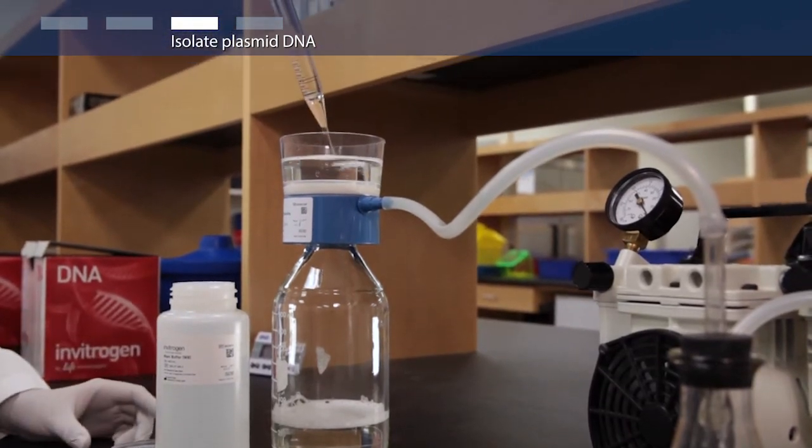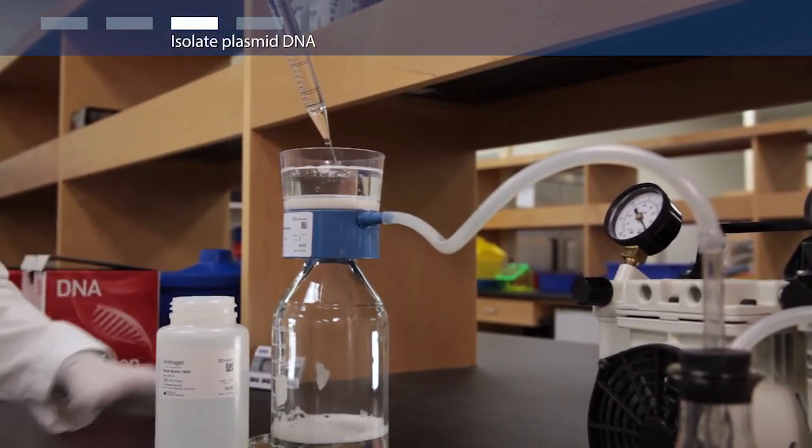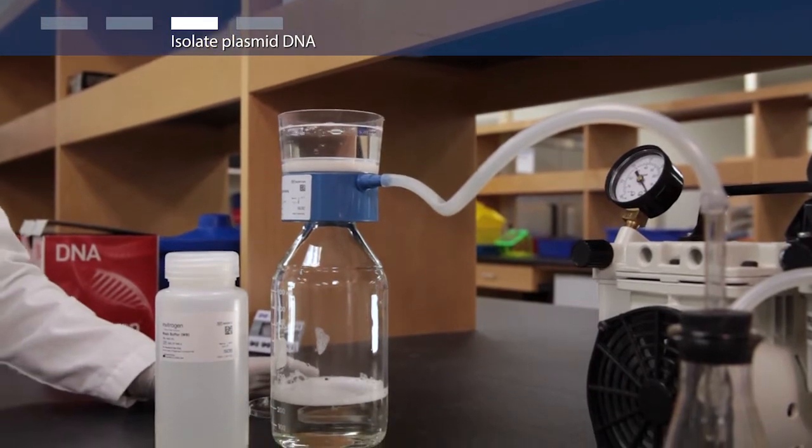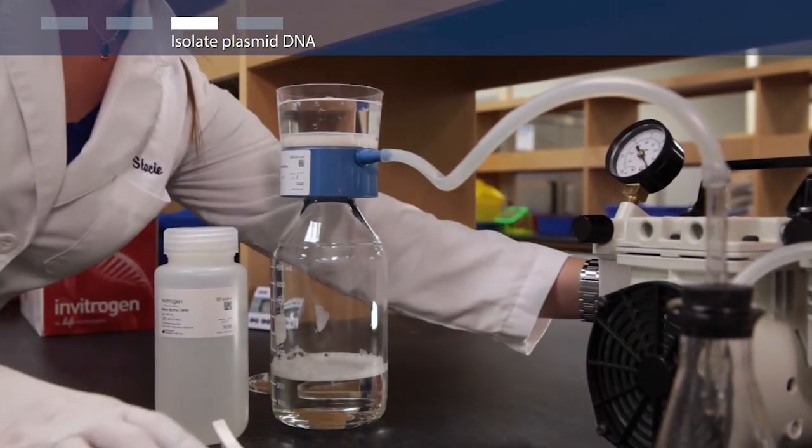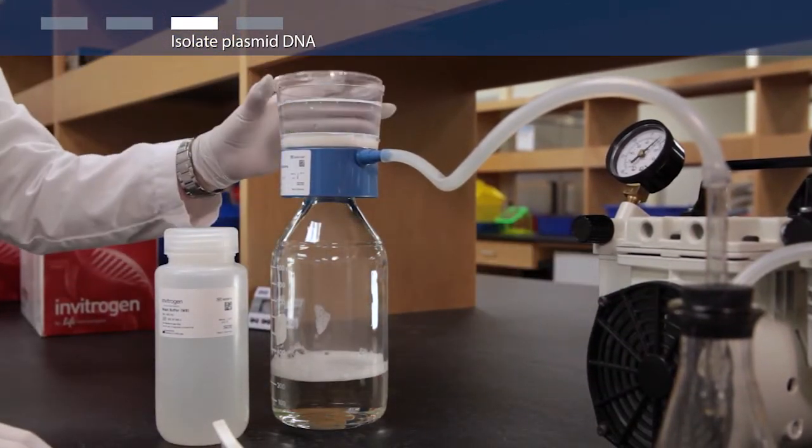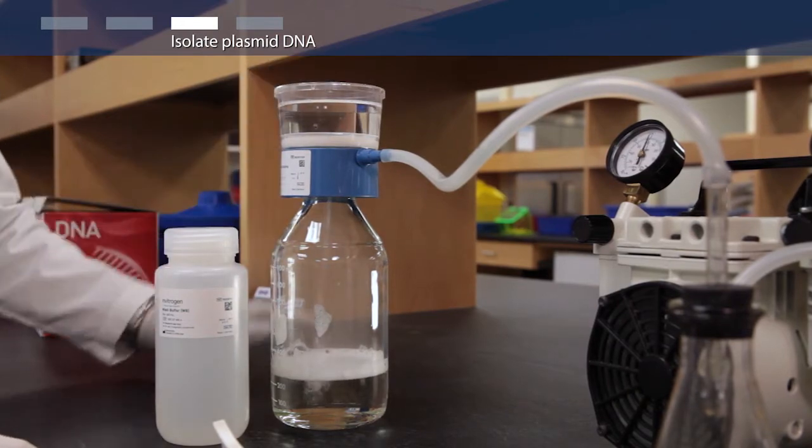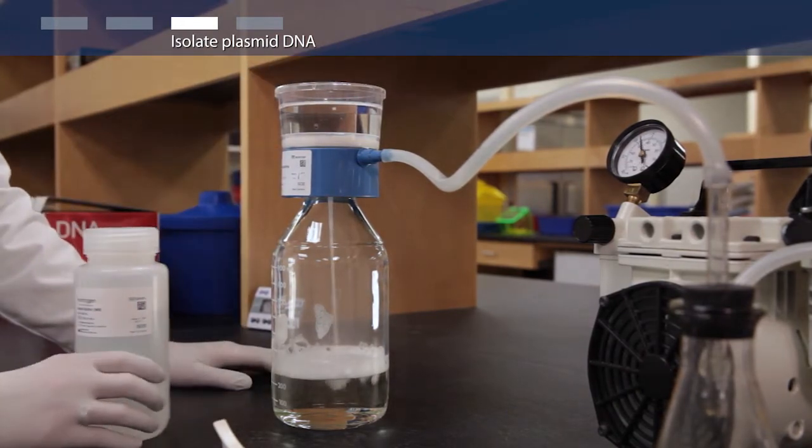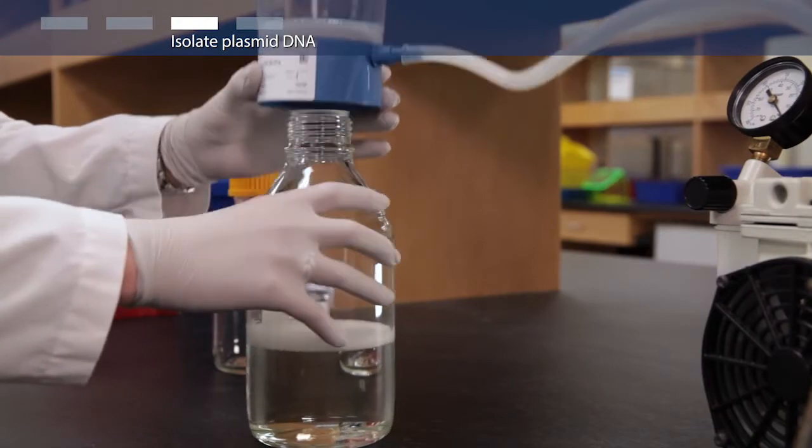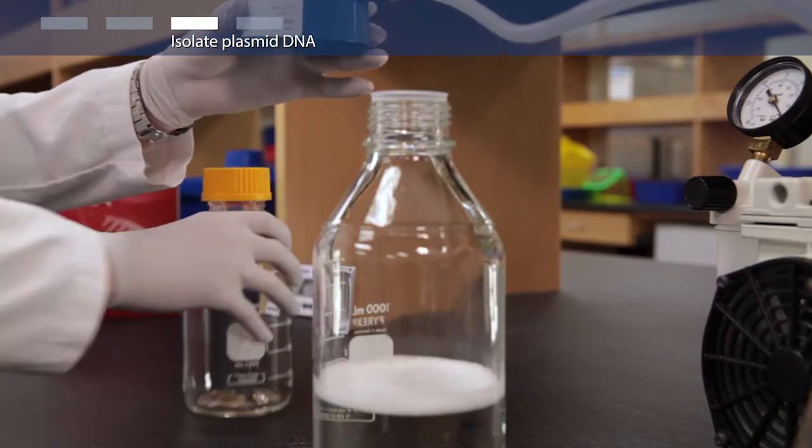Finally, add 175 milliliters of wash buffer and apply vacuum. Repeat, then attach the DNA binding cartridge to a new receiver flask.